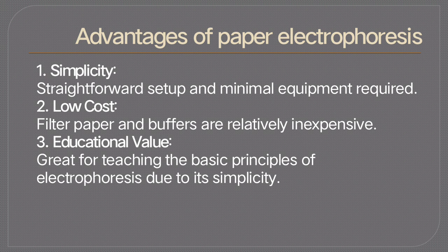Advantages of paper electrophoresis. Simplicity: straightforward setup and minimal equipment required. Low cost: filter paper and buffer are relatively inexpensive. Educational value: great for teaching the basic principles of electrophoresis due to its simplicity.